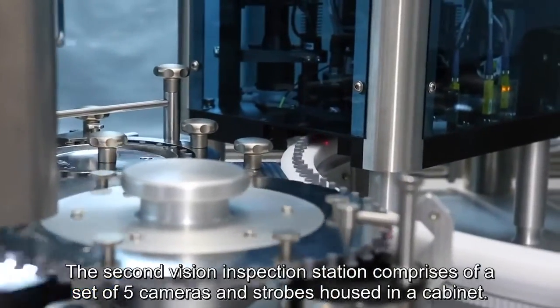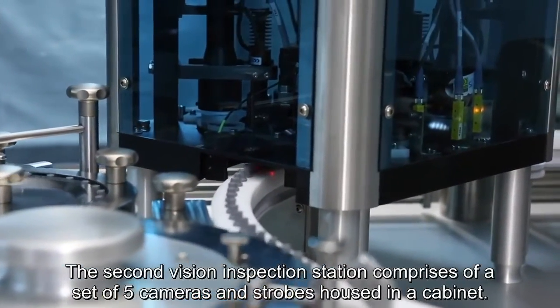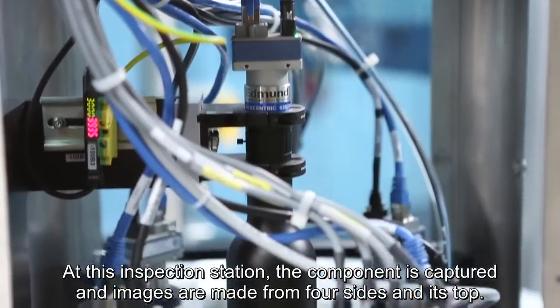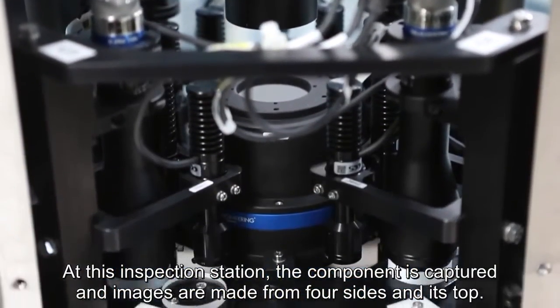The second vision inspection station comprises a set of five cameras and strobes housed in a cabinet. At this inspection station, the component is captured and images are made from four sides and its top.